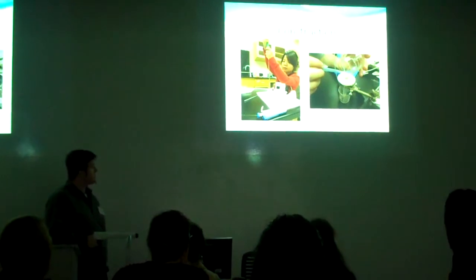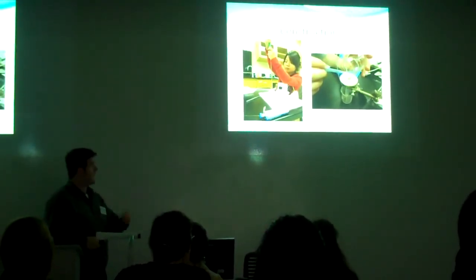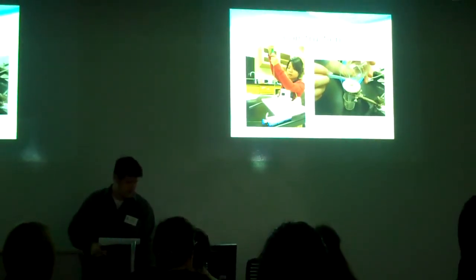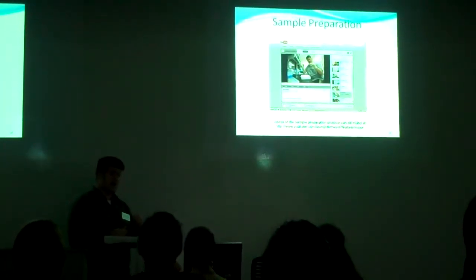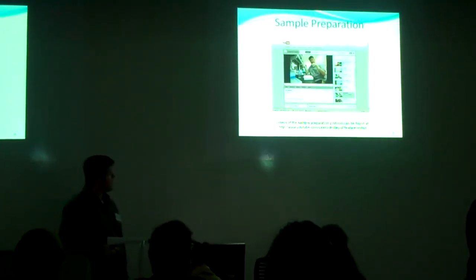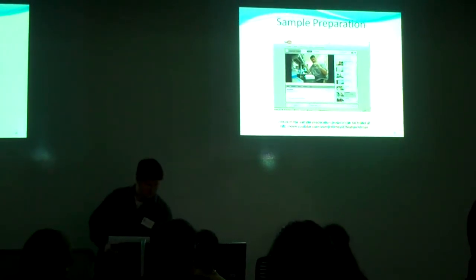She's mixing up the silicone that we use to pour into this clay mold, which we use to make the stoppers. And we made several dozen of these until we got the design right. If you'd like to see videos of preparation of this sample in the dialysis tubing, we've actually posted several videos on YouTube and have a YouTube channel where anybody on the World Wide Web can see those.